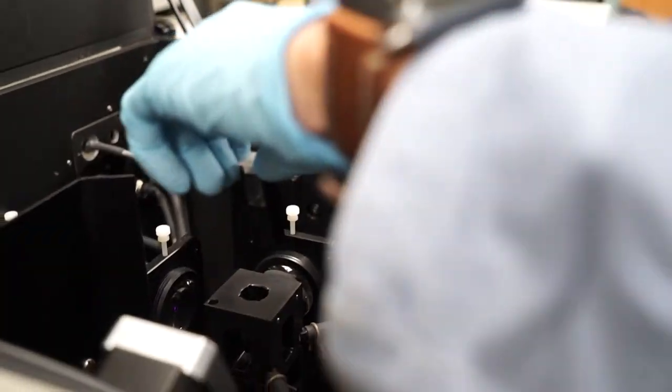Without the spectrofluorometer we couldn't measure the properties of anything that we're creating so this is a real workhorse in our lab.